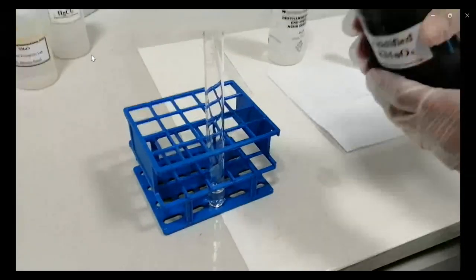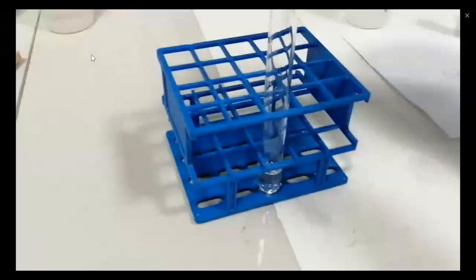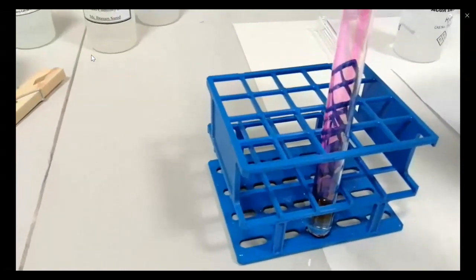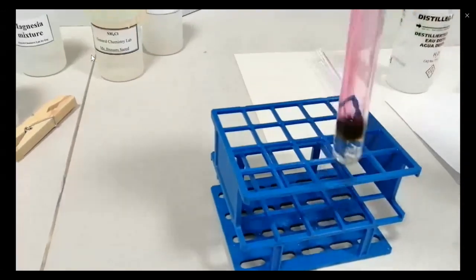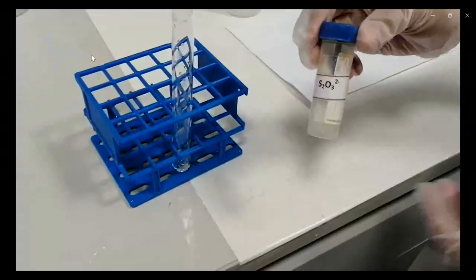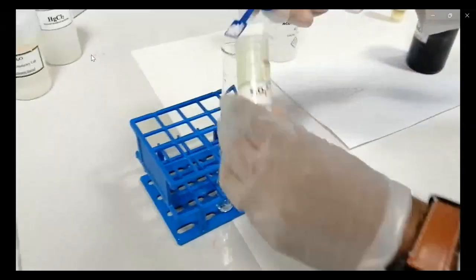You will see its color on the test tube edge, violet, and once it reaches the solution, it discharges to a brown color, which means nitrite is a reducing agent. The same observation you will see with thiosulfate, but you have to prepare a solution first.